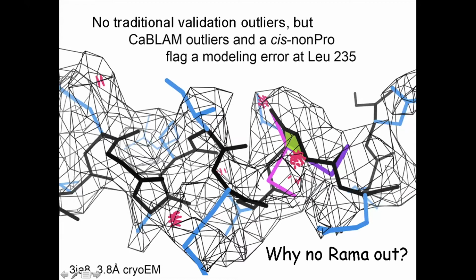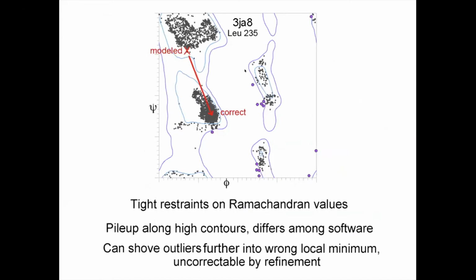Well, again, it's peptides that are misoriented, and often they're bad by almost 180 degrees. For instance, some of you may know that when you have a tight turn, there are 2 good conformations and they orient the peptide oppositely. Very often, if you try to actually turn a peptide, it gets very unfavorable in between, and then it slips into another possibility.